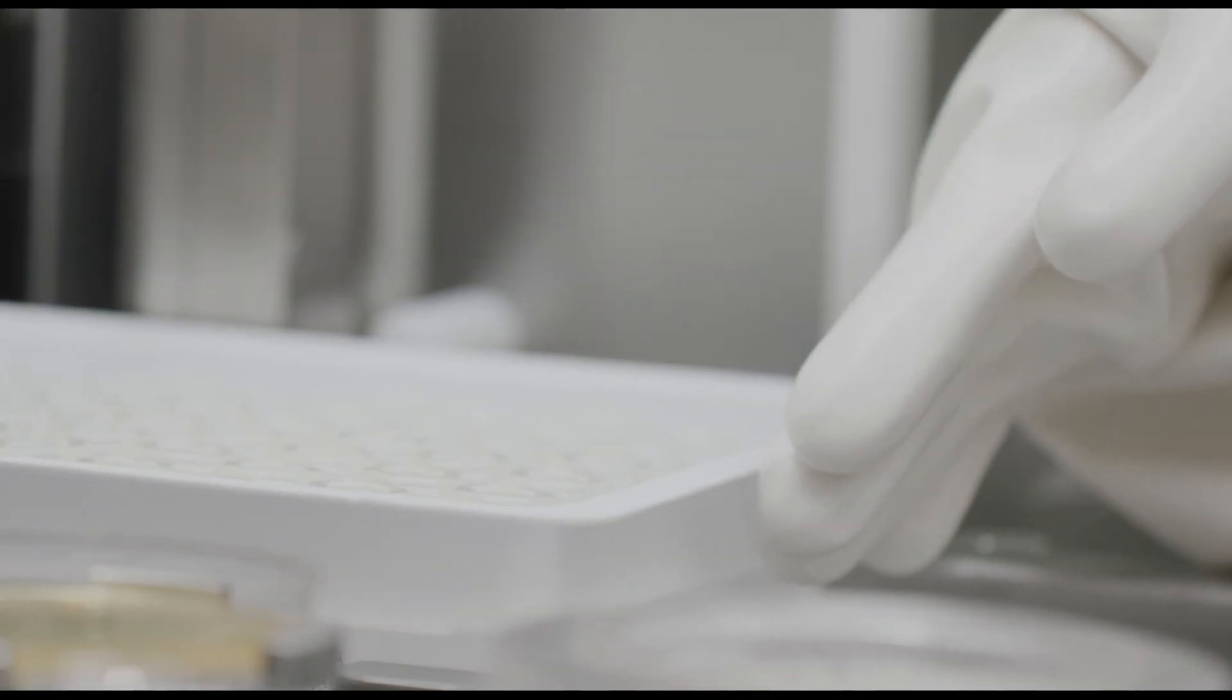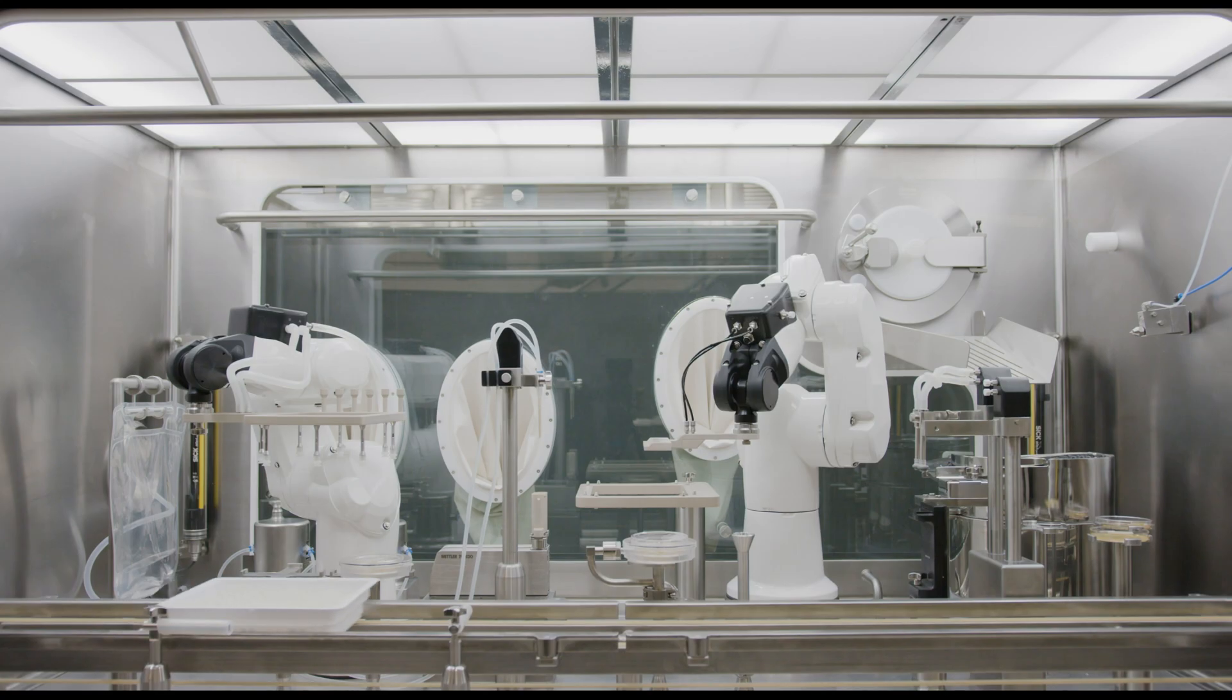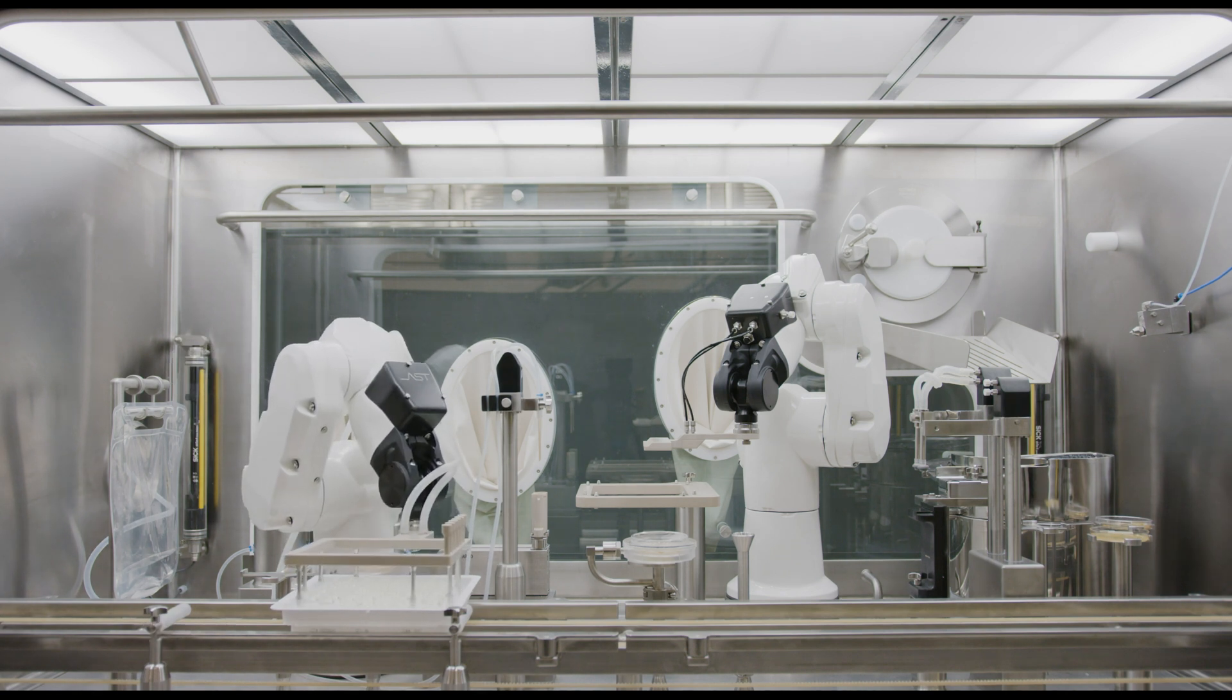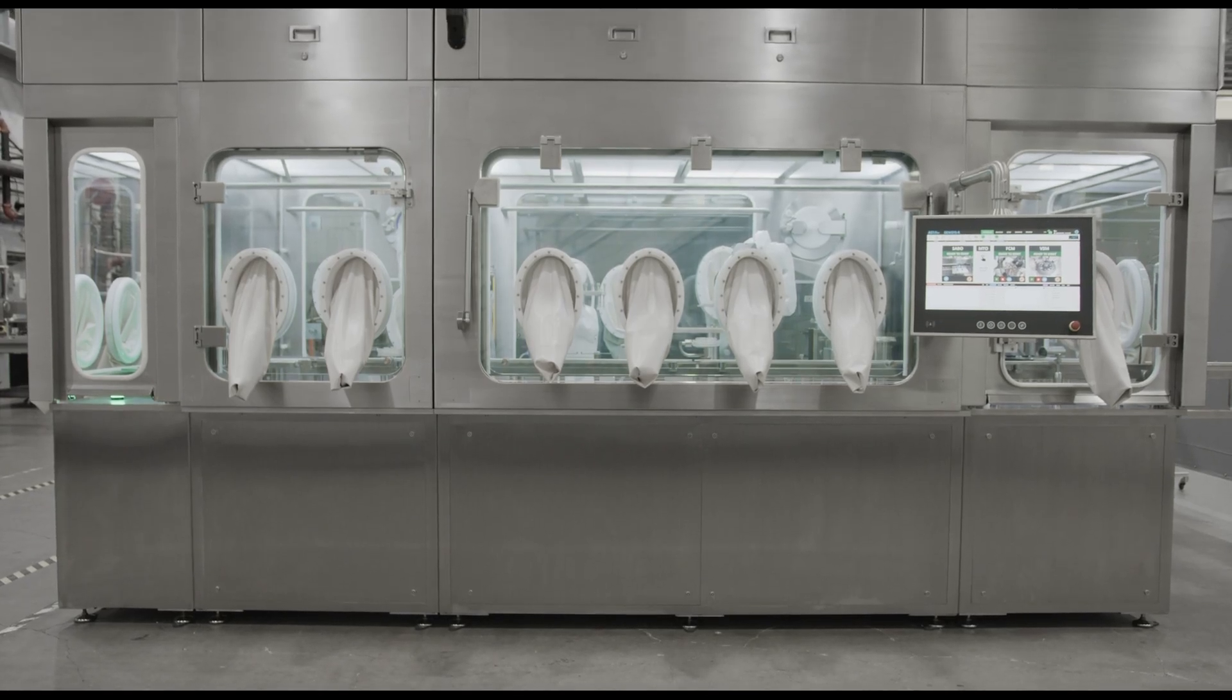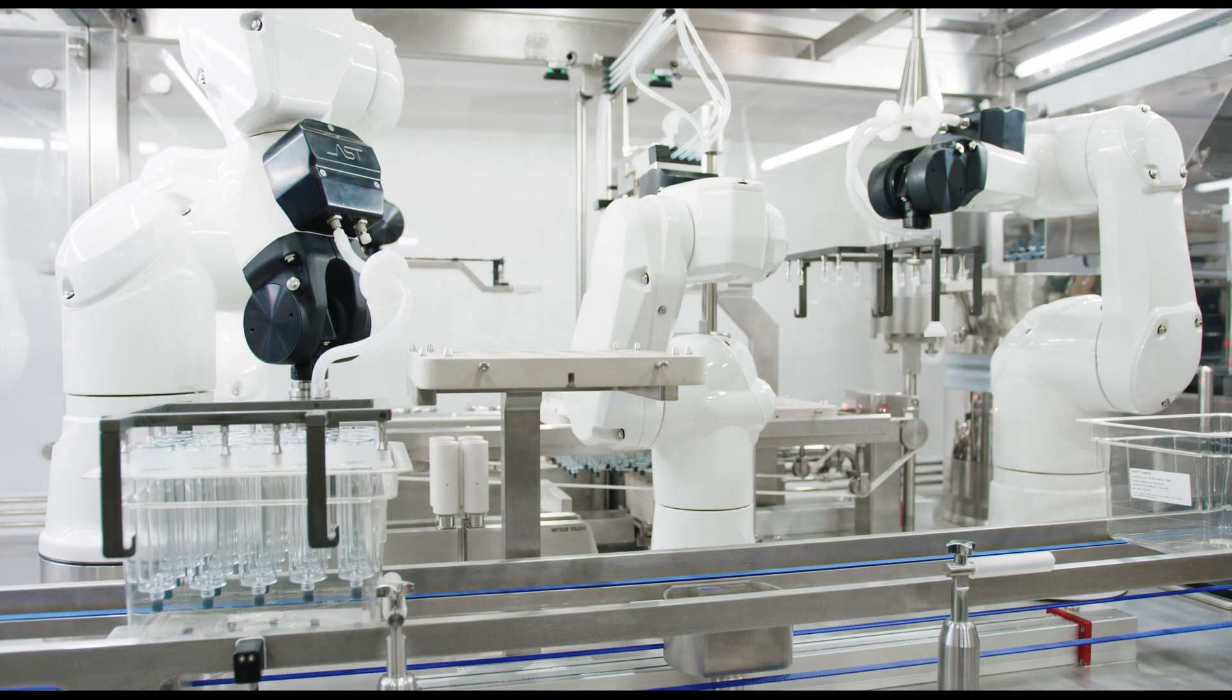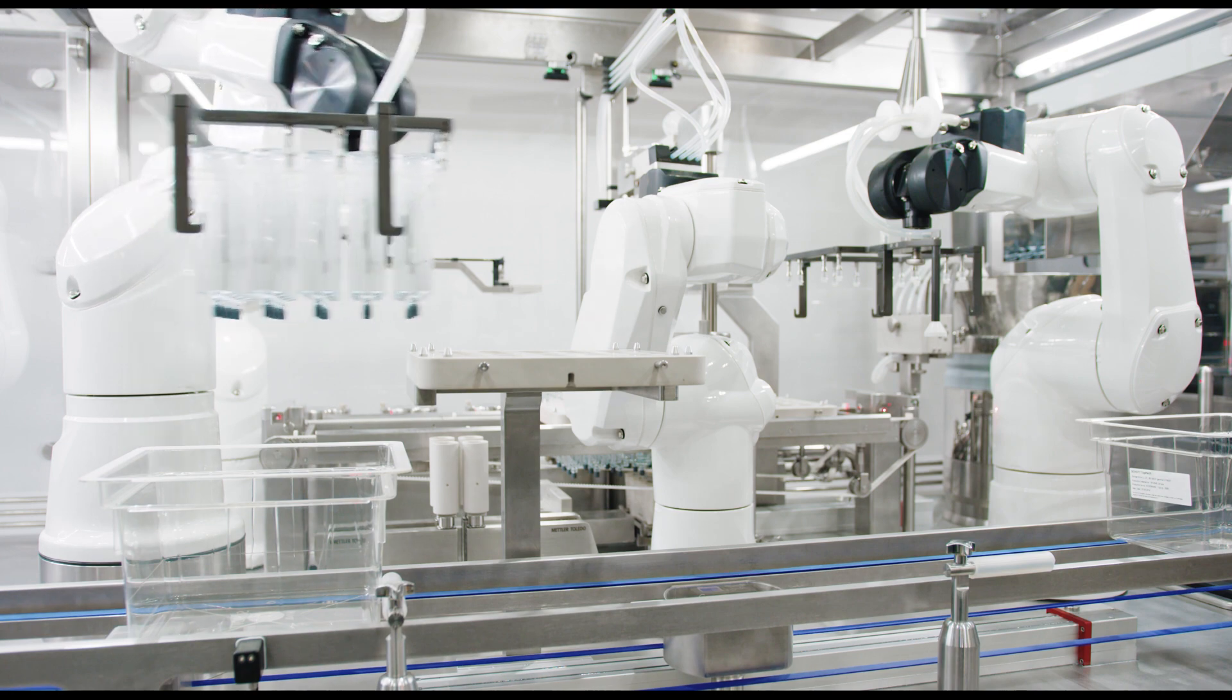The Genesis R is designed for customers who need a high rate of IPC, or in-process weight checks, while the Acepticel provides higher throughput. Both are highly flexible with minimal change parts and some of the most compact systems available in their market segments.